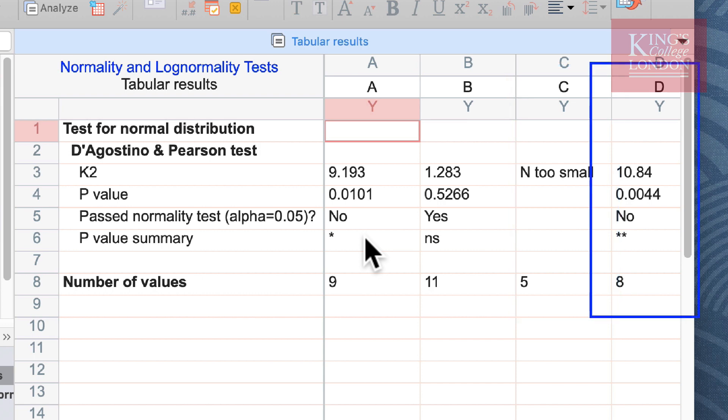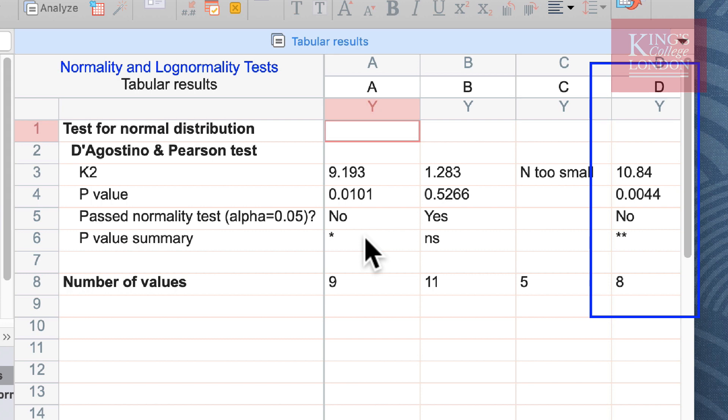If you remember from the graph I questioned the distribution of group D thinking that they were a little bit too tightly bunched to be normally distributed, and you can see here it failed the normality test with a p-value of two stars. This really shows that these data are not normally distributed and would be unwise to carry out a parametric test on these data.